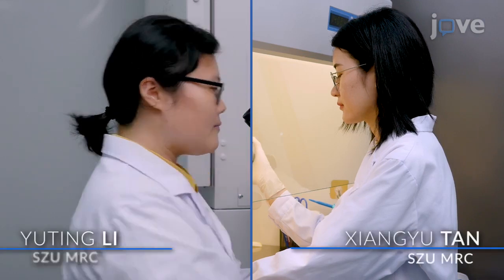Demonstrating the procedure will be Yuting Li and Xiangyu, research assistants from my laboratory.